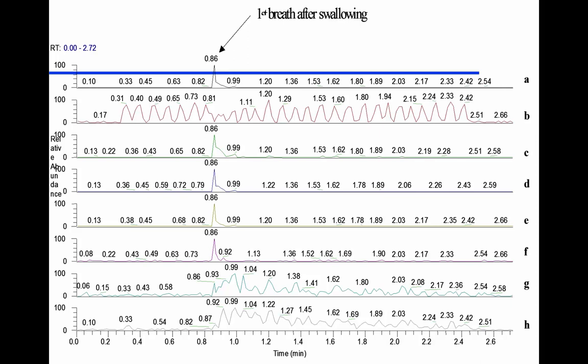If you start hooking the mass spectrometer up at this point, this is acetone. That's normal in metabolism of the body. You're exhaling acetone all of the time. And so this is when he's exhaling, so the concentration goes up. When he inhales, he's drawing room air in across the mass spectrometer. Exhale, inhale, exhale, inhale. So we keep track of your breathing pattern. At this point, he took a sip of the beverage. And then we're interested in those strawberry flavor components. Here's one flavor chemical in the strawberry, another flavor chemical, another one, another one, another one. So we're interested in how each is given up.